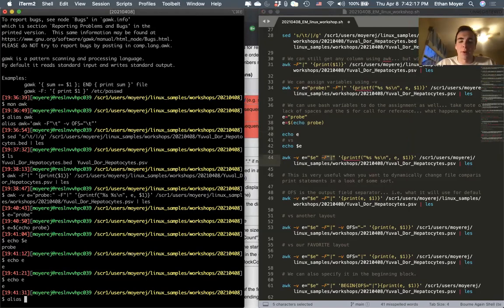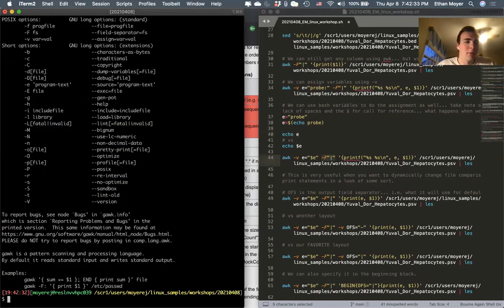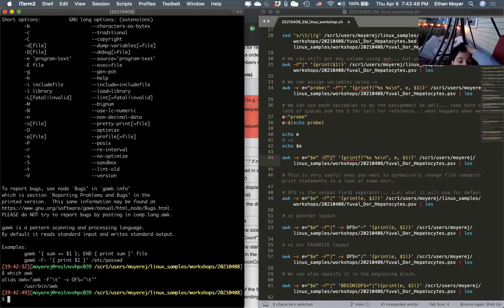So that's a good question. The reason why Wanding has this for its -F \t is because the default setting is a space, and you can see that here. There's dash capital F, field separator. It might say it here. So you're saying by default it is \t. Yeah. So it is. That's why we have a lot of TSVs. Yeah. Okay, that explains a little bit there.